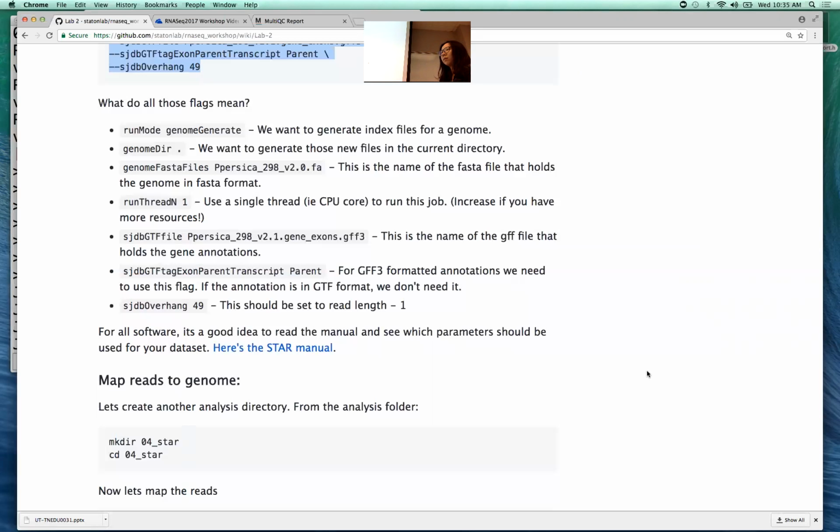We're taking the genome and we're looking at every word. In the case of this, what did you say the default word size was? Like 31, 27? I'd have to look what the default word size is. You mean the k-mer? No, there's probably a default word size for STAR too. You probably can adjust it. But anyway, it breaks the genome up into these words, and then it makes a giant index, just like the index of a book, where it says the word ATCGGGCTATCG is found at chromosome 1 at location 150,000, on chromosome 13 at location 200,000. So it's creating this giant index.